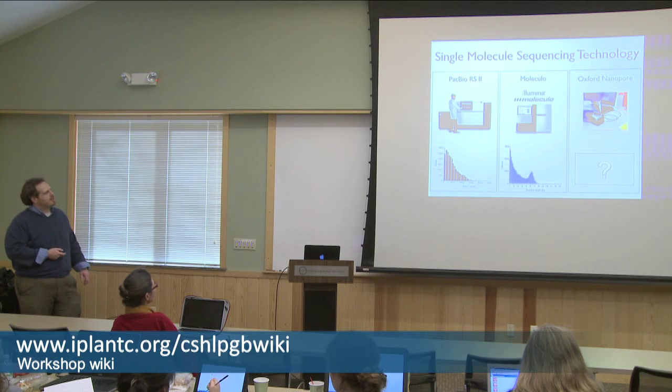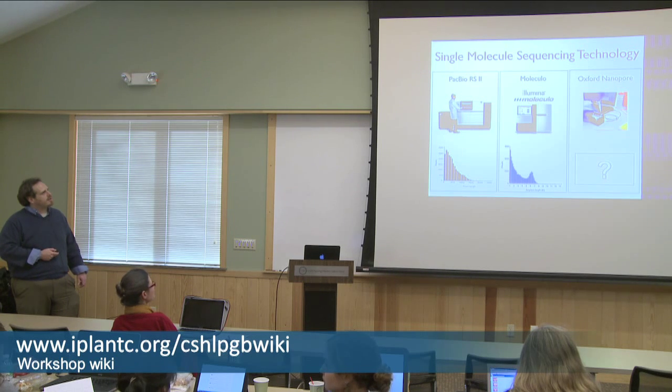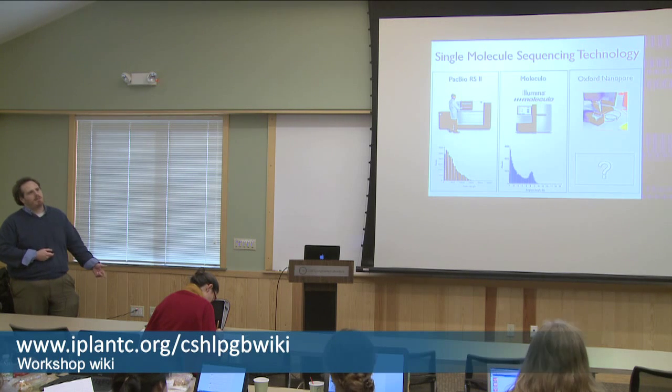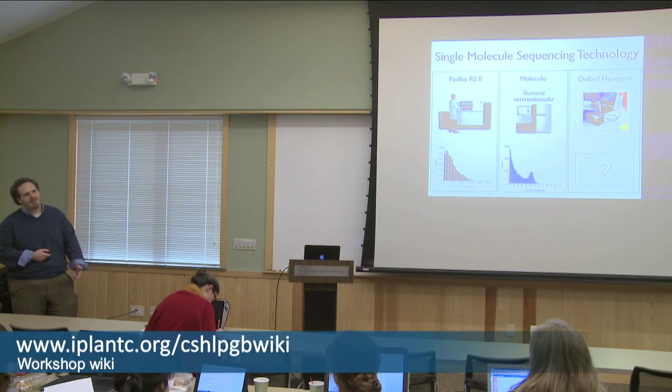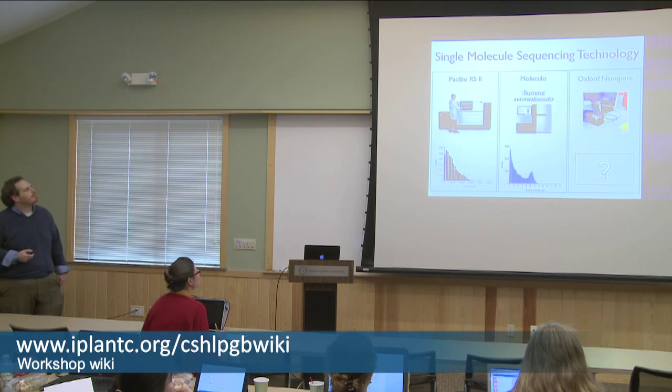But my interpretation of this is they're still trying to optimize the microfluidics and the barcoding and everything to make this work. This technology was announced about a year ago. At that time, they said in 6 months it would be available as a kit. It is not available as a kit today. I have no updates on when the kit will be available, if ever.